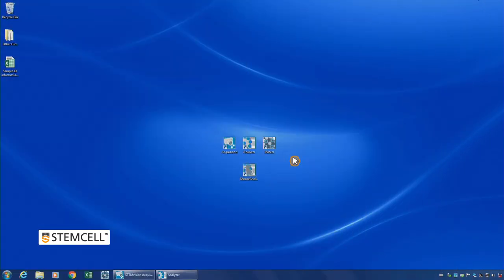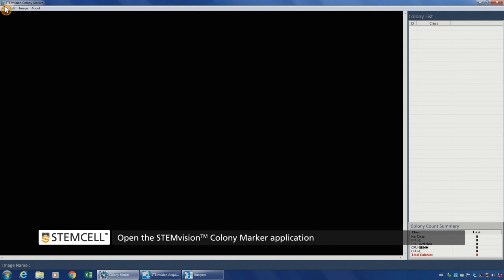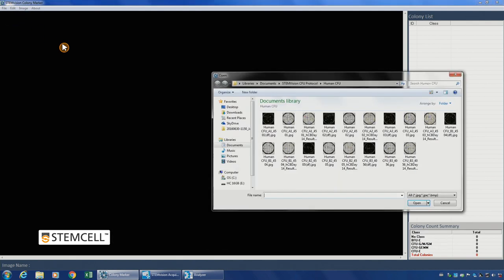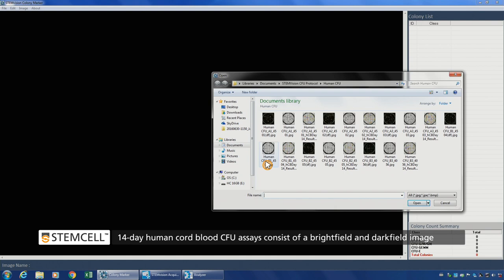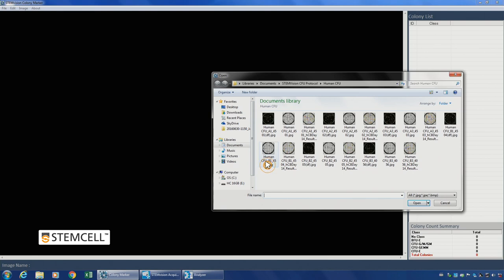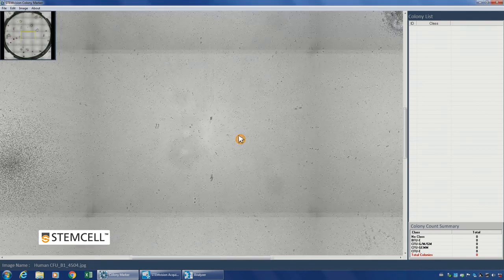To view your analyzed images, start the STEM Vision Colony Marker application. Click File, Open Image, and select the image you want to view. Human 14-day assays consist of both a bright field and a dark field image. Opening the bright field image will display a composite color image of the culture.